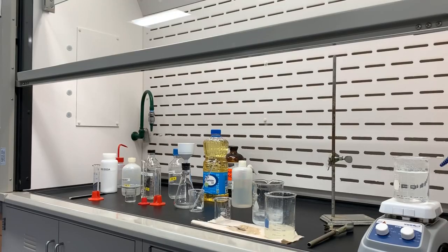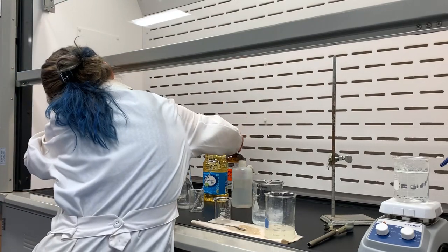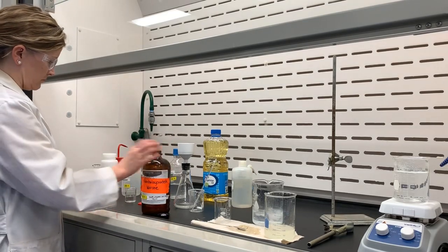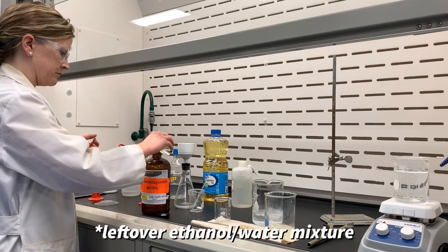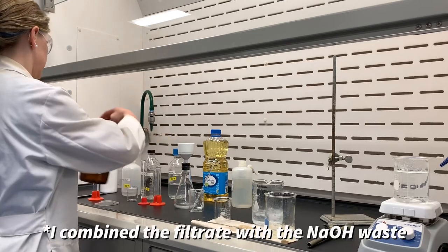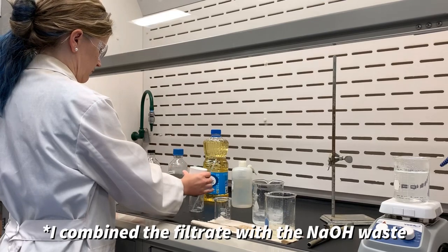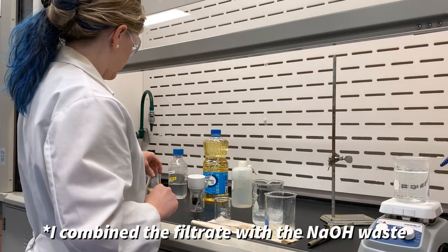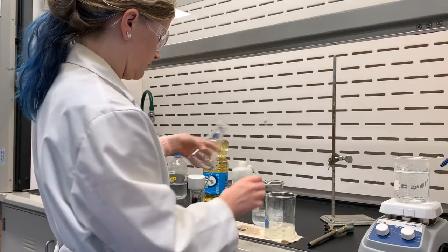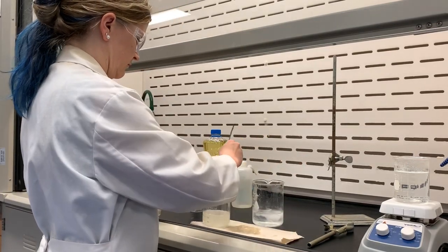After obtaining the mass of the product, it's always important to clean up — a clean lab is a safe lab. In the non-halogenated waste, I put the filtrate from the filtration. Then I neutralized the sodium hydroxide decanted liquid with baking soda, sodium bicarbonate. Once that was neutralized, I put that down the drain with a lot of water.